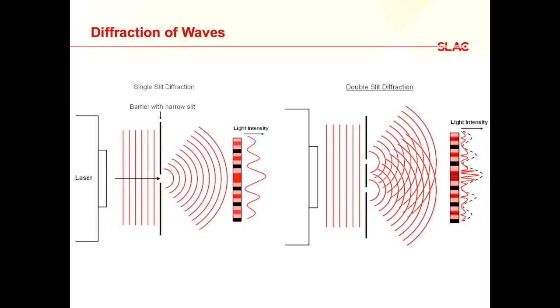In this case, it goes from a planar wave to a circular, spherical wave. So if you measure the pattern of light on a detector a certain distance away, you will be able to deduce that this is a spherical wave and that there was a single point object at this location. So it all starts from that very simple principle.